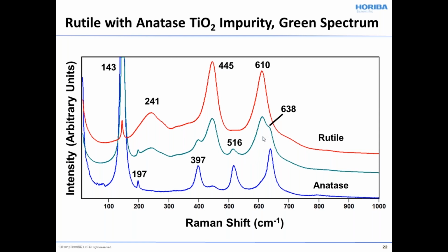But if you, by micro Raman spectroscopy, just focused on this grain, what you would find is that the grain actually consists of two phases, because clearly there's rutile, right? So you see the bands of rutile, they correspond right here. But then you also see peaks showing up that you can attribute to the anatase. So this is a grain that happens to have both phases within it.